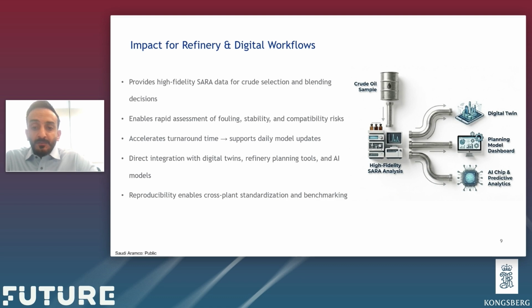This is especially valuable if we want to talk about what can potentially be done from this, such as digital twins, planning models, and machine learning workflows that need consistent input and reproducible data across different labs. Because this method is reproducible across labs, it becomes possible to standardize SARA measurements across plants and build reliable benchmarking datasets.